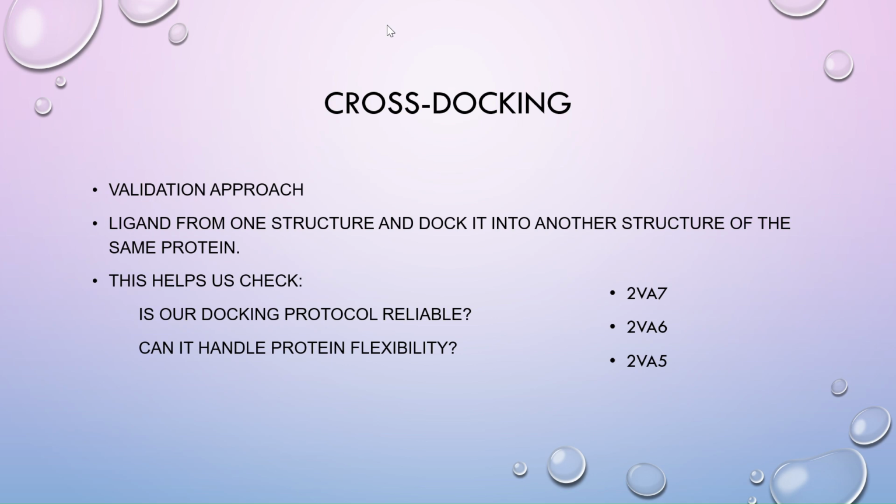Hello everyone, in today's video I will show you how to perform cross-docking step by step. And trust me, this method will make your docking study much stronger and more publishable. We will use three crystal structures of BACE1 whose PDB IDs are 2VA7, 2VA6 and 2VA5. And I will guide you from downloading files all the way to RMSD analysis. So let's get started.